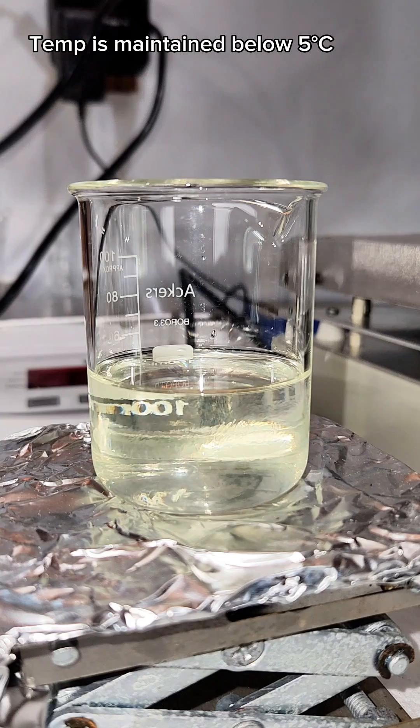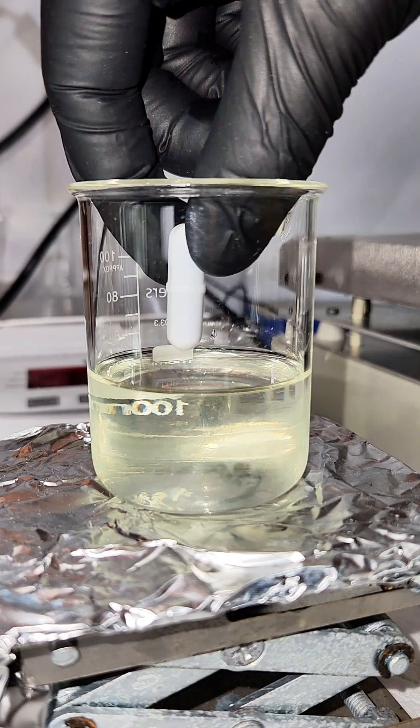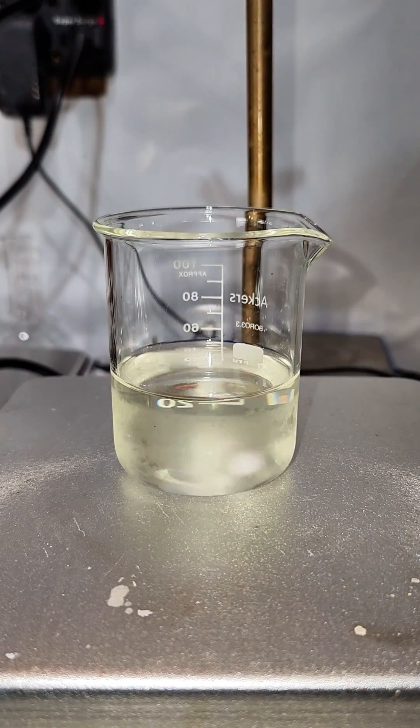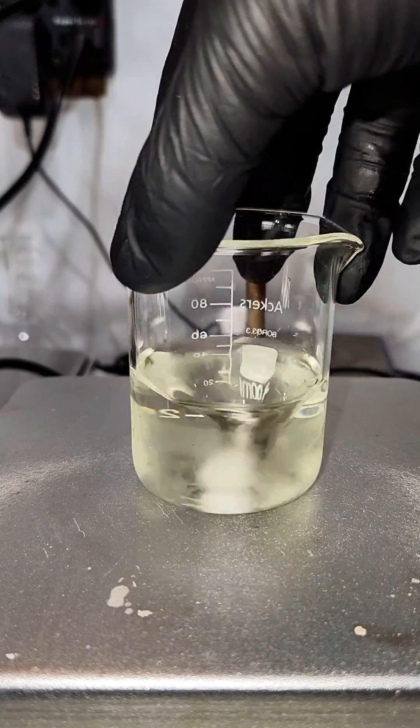What I've done here is basically made a really alkaline bleach solution and so it's really important that this is done at a low temperature or it will decompose the sodium hypochlorite.